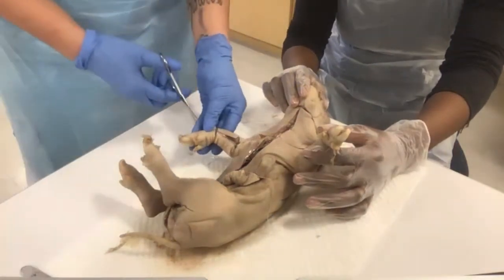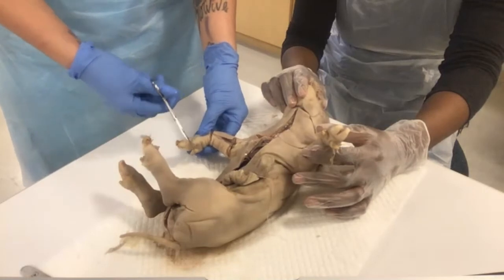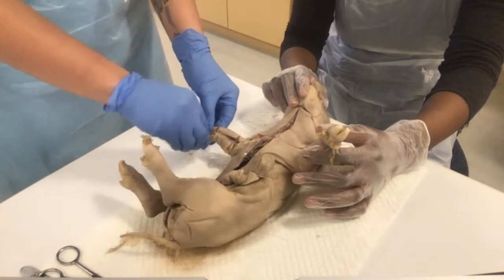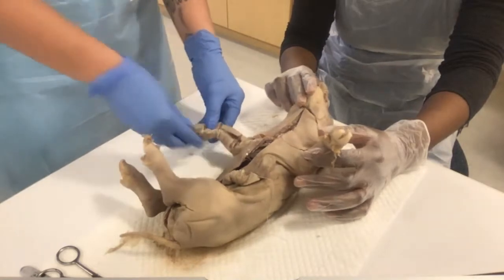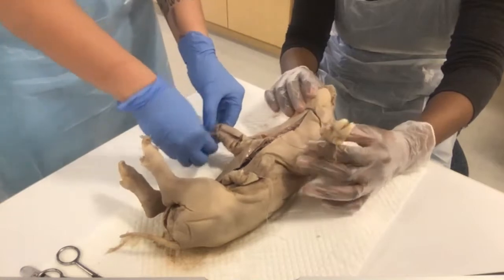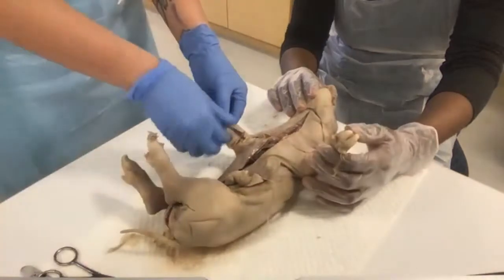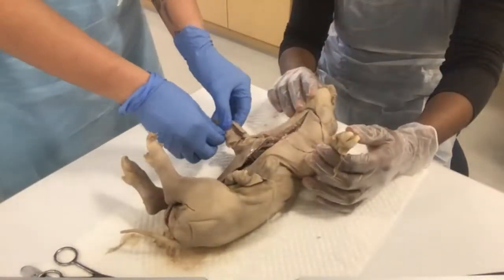So what are we looking for? Now, remember that extra skin? That extra skin, if you recall your muscle lecture or video that I made, it wraps around the muscle. And do you see how, if this is too small to look at, use your imagination.